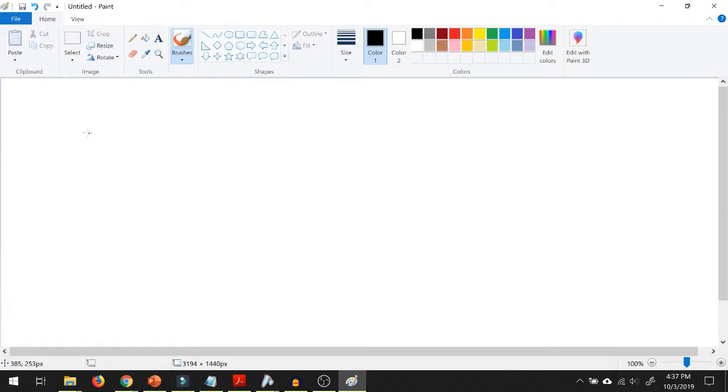Now, what you're going to do, step one, is to grow up fresh bacteria. Fresh DH5 alpha bacteria. So make some LB agar plates if you don't have any. Take your DH5 alpha stab and streak it out. If you don't know how to streak out bacteria, there should be a document about how to do that. You could also search it online.